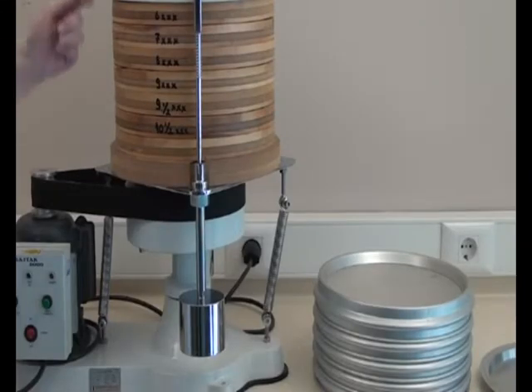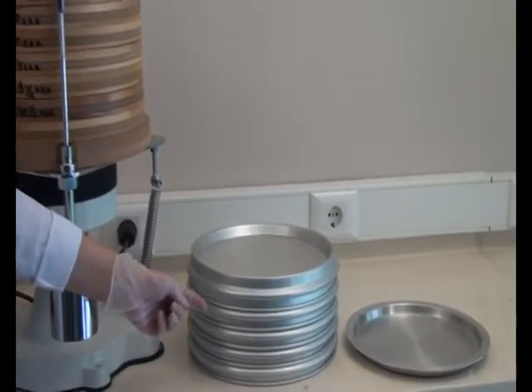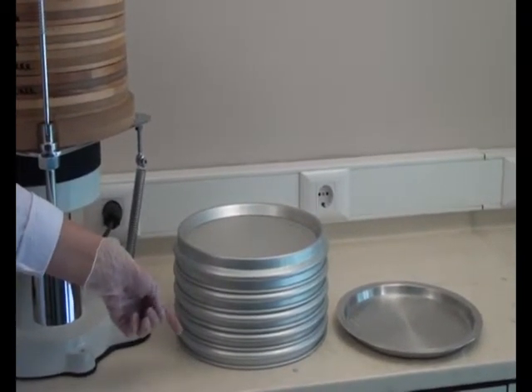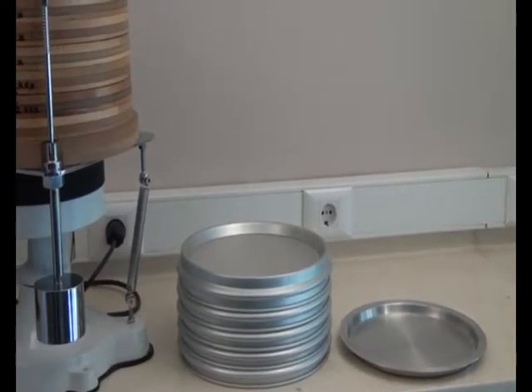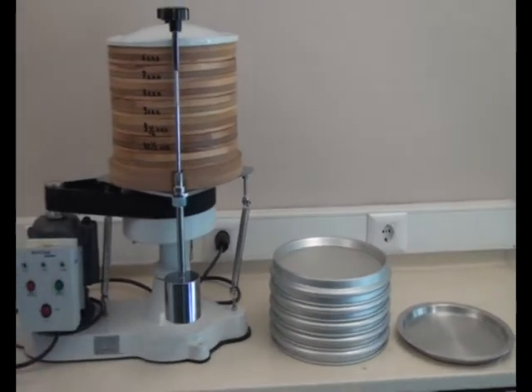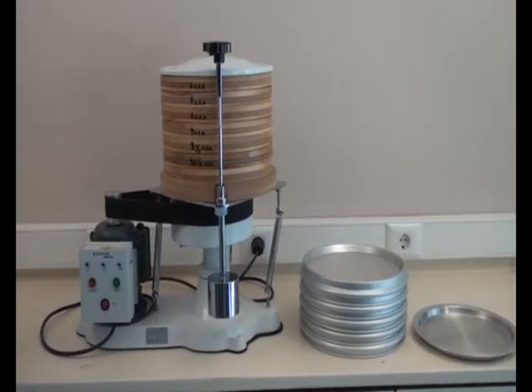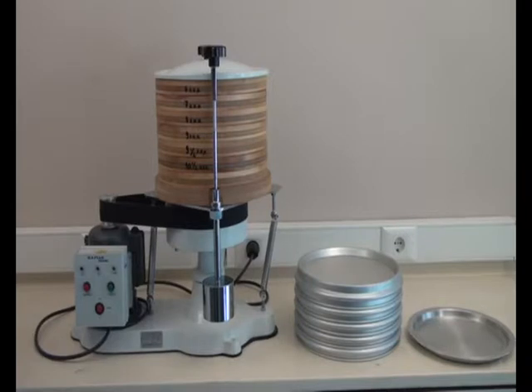When the wooden frame of the instrument is changed to an aluminium frame, it can be used in the spice sector for classification of spice, and in the mining construction sector for separation and classification of soil, sand and stone. The sieves mounted into the wooden frame can be changed. A collecting box can be placed under the desired sieve so the under-sieve amount of the sieve can be determined.